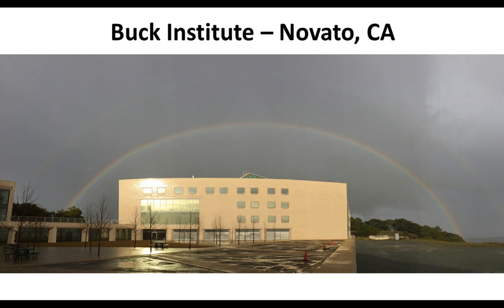Yeah, we have actually a lot of different samples in our institute. We sometimes also get C. elegans samples or Drosophila. We have a broad spectrum. I have in the past worked with serum, or actually rather plasma, and we did a lot of glycosylation analysis.